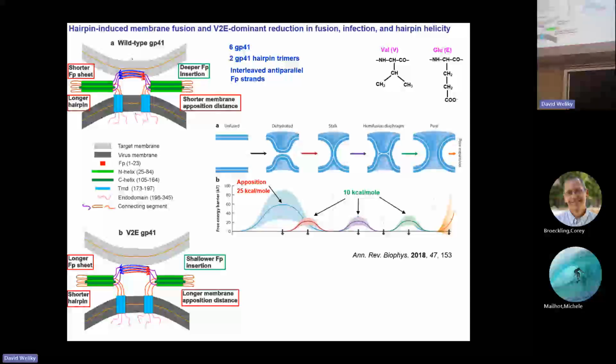But are you measuring, especially for this peptide where it's more membrane-associated, the state where it's on the surface of one membrane and then pushed up against the surface of another? I'm just trying to picture what the system looks like. Sure. Of course, probably in the centrifugation process, you don't have vesicles anymore. Right.